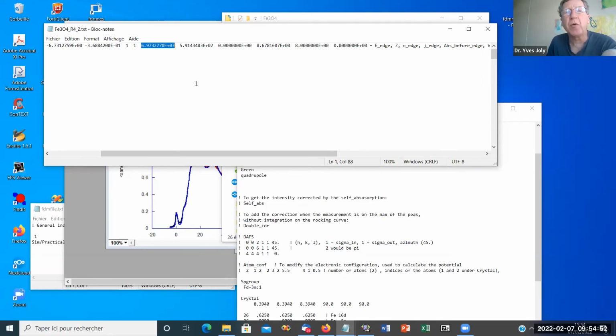First, I have to mention that in this structure, Fe3O4, you have two kinds of iron with different oxidation states, and so both edges are slightly shifted, but it's automatically done in the calculation. The shift I was mentioning, due to the core edge between the two sites, is automatically done for you. Okay? But now, if you make two independent calculations, it cannot be done automatically for you. So that's why you have to give a reference for this core level.